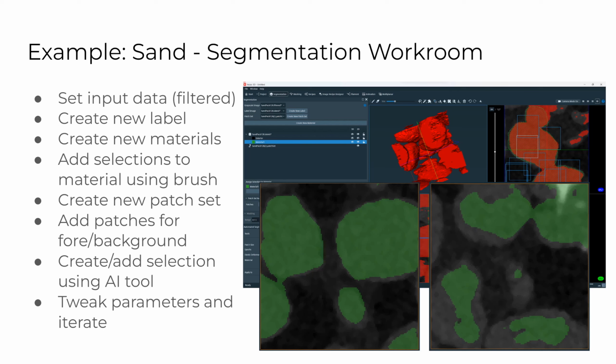So remember I said one of the parameters you can tweak is the size of this patch, right? And that's correct actually. Ideally you have to set the size of the patch so that the whole structure fits in the patch, so that the model can learn this.